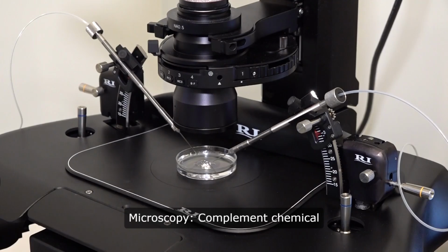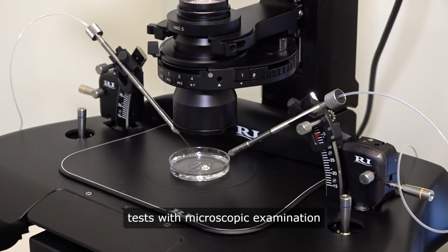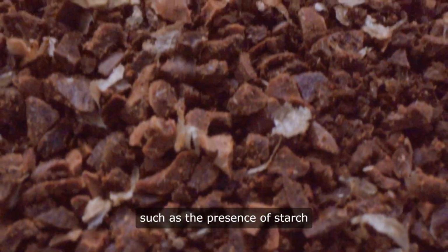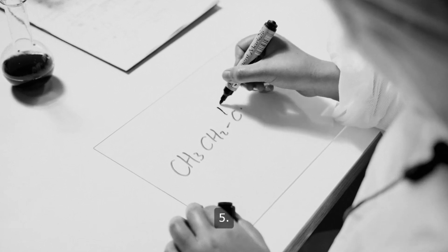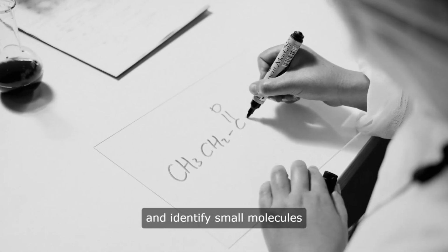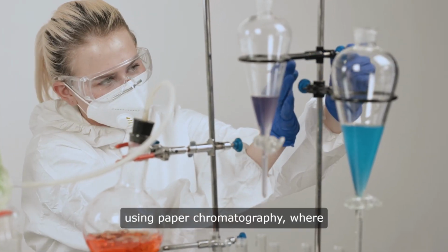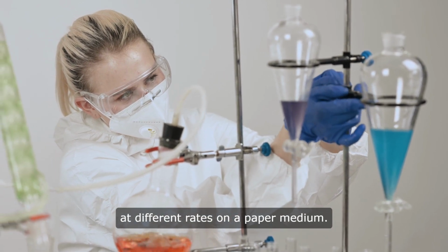4. Microscopy. Complement chemical tests with microscopic examination to observe structural details such as the presence of starch granules or fat droplets. 5. Paper chromatography. Separate and identify small molecules like amino acids or simple sugars using paper chromatography, where different molecules migrate at different rates on a paper medium.